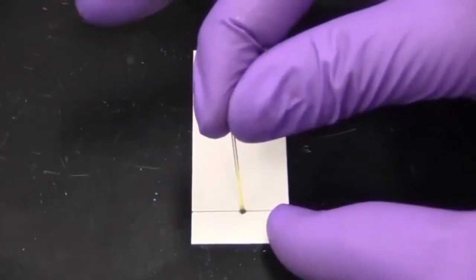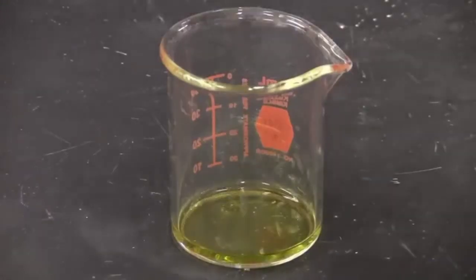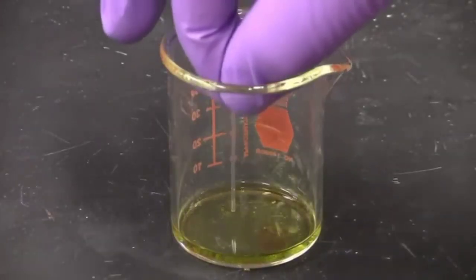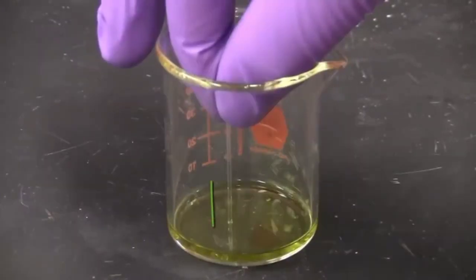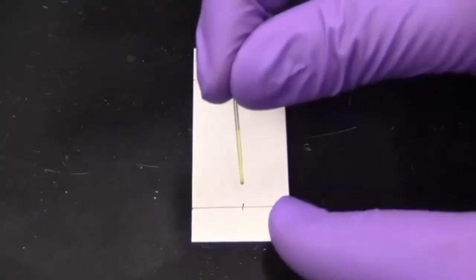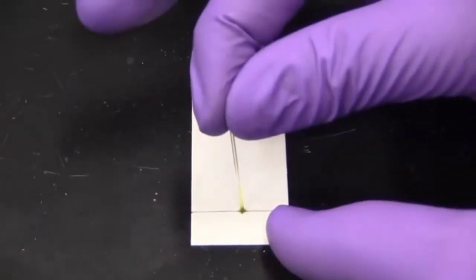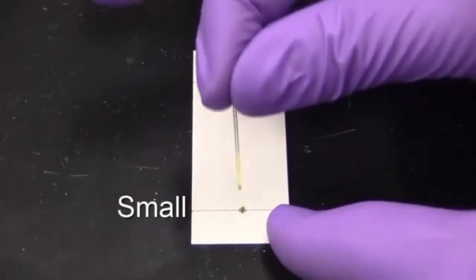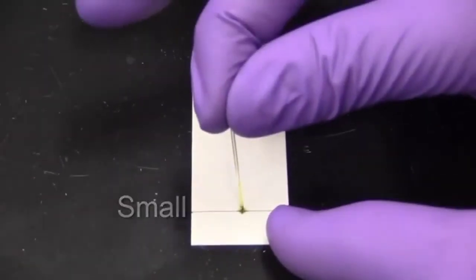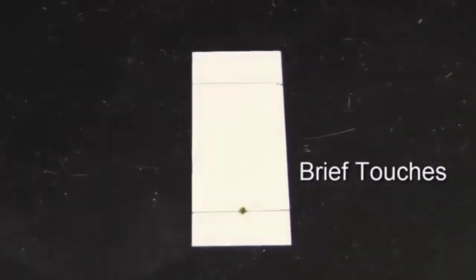Using a microcapillary tube, load the sample onto the TLC plate. To load the sample into the microcapillary tube, simply touch it to the surface of the sample. You will see the sample travel up the inside of the tube due to capillary action. Press the tip of the tube briefly to the TLC plate on the tick mark at the start line. Repeat this process until you have a concentrated point of sample. Keep the sample spot as small as possible in order to maximize your resolution. Multiple brief touches with the microcapillary tube are best.